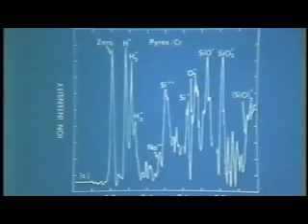That means you don't have to propagate a high voltage pulse. Okay? And that in turn means that you can use silicon samples as well. That work is primarily being done by Tsien Song and Gary Kellogg. Tsien at Penn State, Gary Kellogg at Sandia National Laboratories, who pioneered that variation of the imaging atom probe called the pulsed laser atom probe.